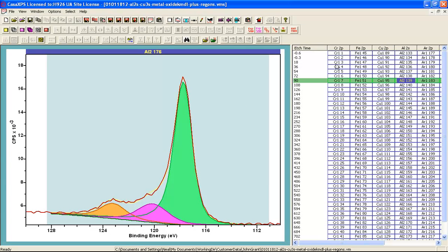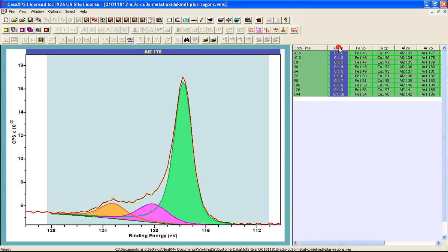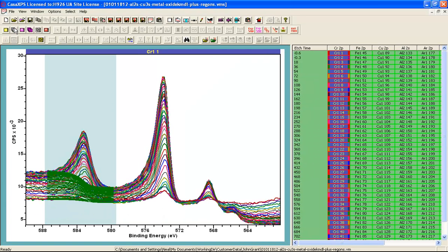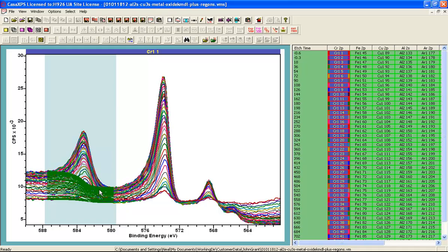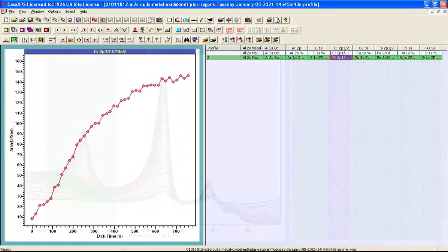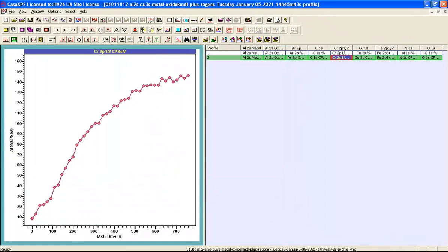Each one of these columns represents a sequence of measurements from the same element and transition and upon each spectrum within this column there is a background that has been defined over a region and this will be used to integrate the signal from a peak. This will form the trace in this case of a chromium 2p one half peak.